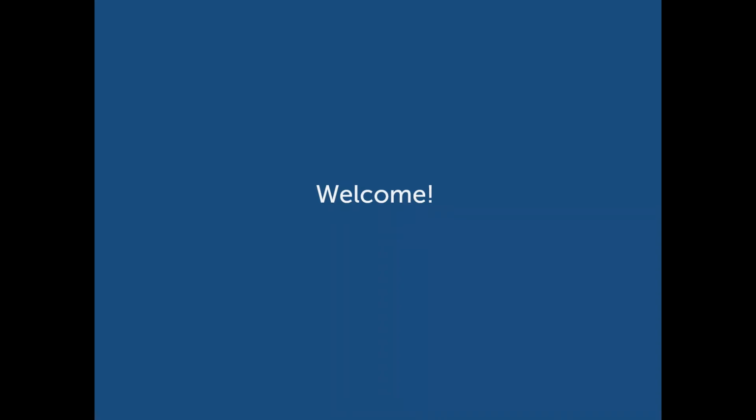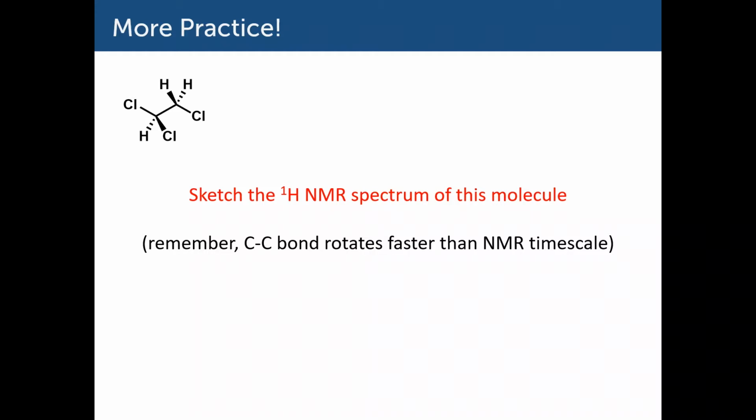Welcome to our fourth video on NMR spectroscopy. In this video, we'll be looking at more NMR spectra, along with our third major piece of spectral information that we can interpret to determine the structure of a compound. So to get started, we'll work another practice problem.